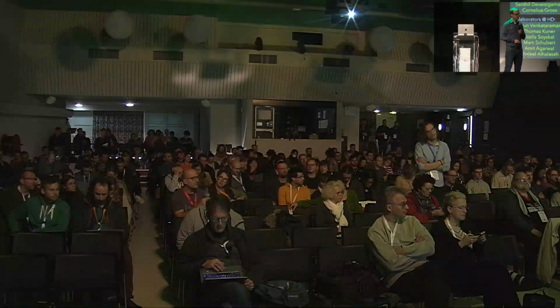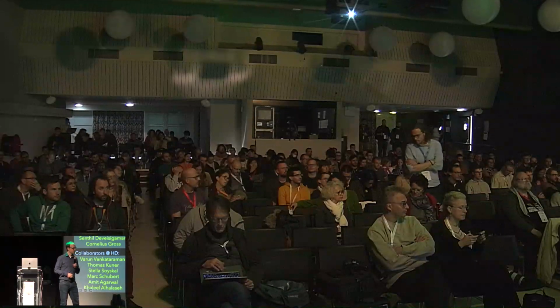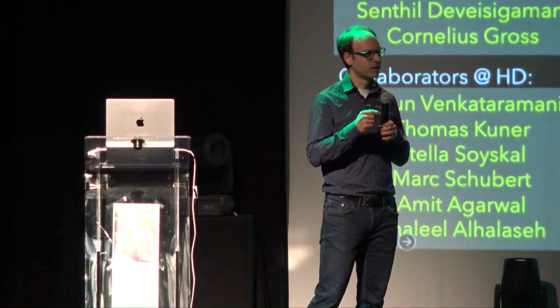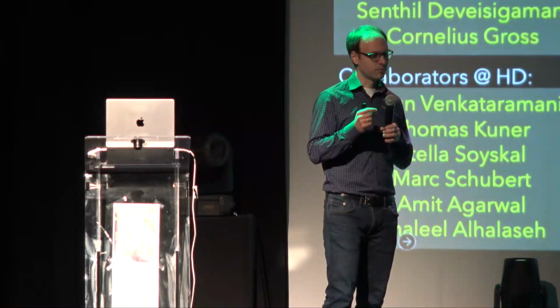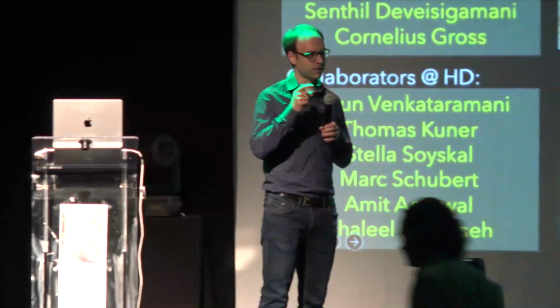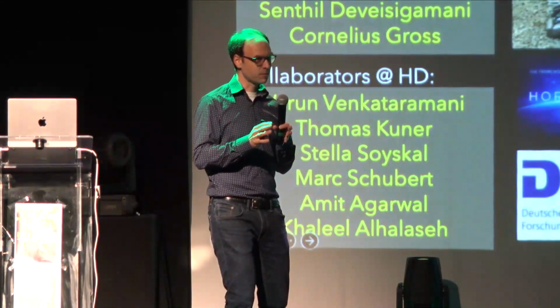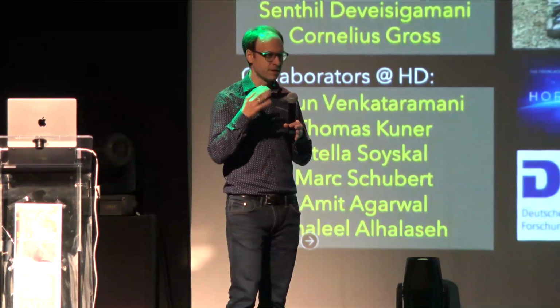Yes, so I can comment on all of this. So first of all, I want to highlight that when I speak about adaptive optics improvement, this is really the improvement due to the tissue aberrations. So what we do, in the field we call systems aberrations. We subtract them, so we basically don't show them.